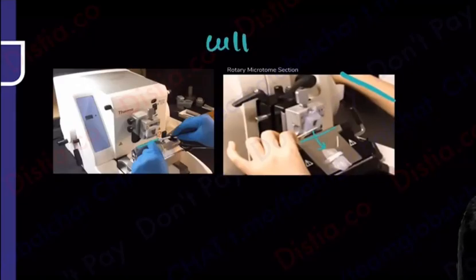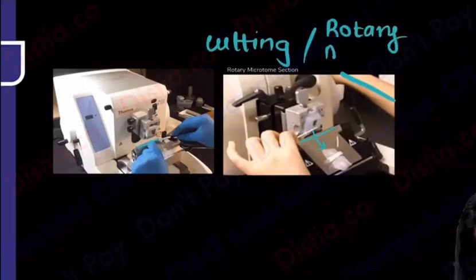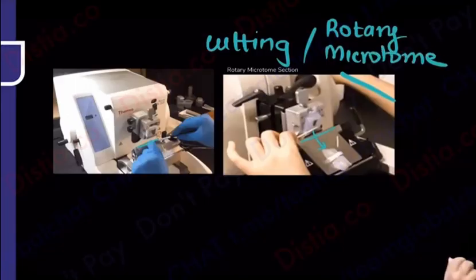So this process is known as cutting, and cutting is done by something known as a rotary microtome. Guys, in your local market you must have seen tailors and how they work on that sewing machine. On one side they rotate the wheel and the needle keeps working on the other side. Same way, on one side I'm rotating a wheel over here, that's rotary, and microtome means cutting. As I rotate once, tissue is cut. Rotate a second time, tissue is cut. So it's a rotary microtome which you use for cutting.